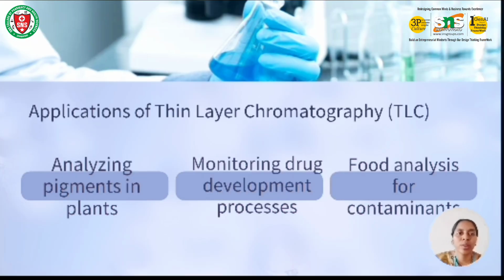Applications of thin layer chromatography. With the help of thin layer chromatography, we can analyze the pigments present in plants, and we can also monitor drug development processes, and it is used for food analysis for contaminants.